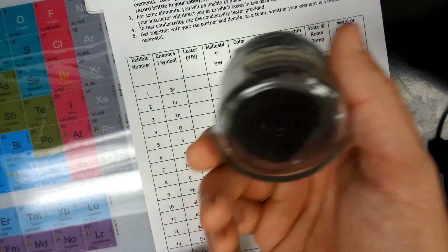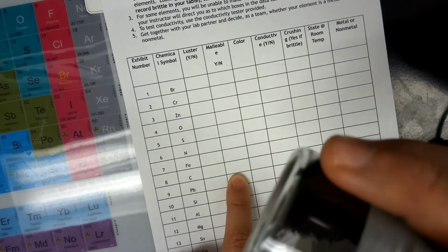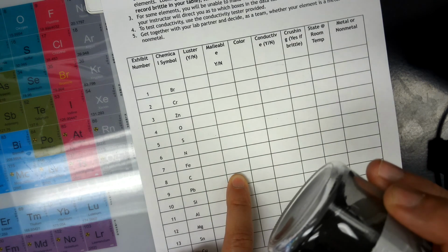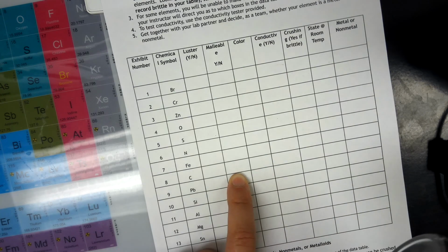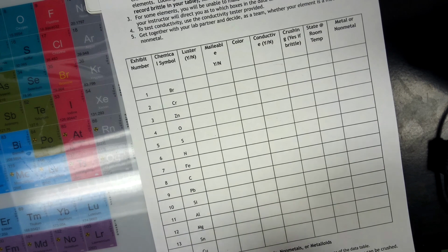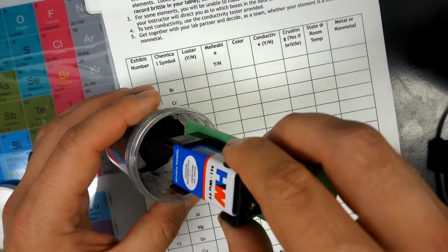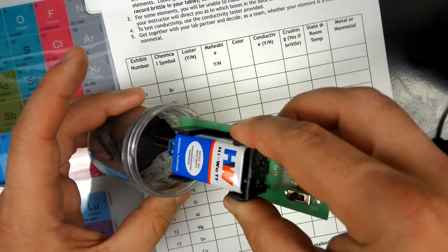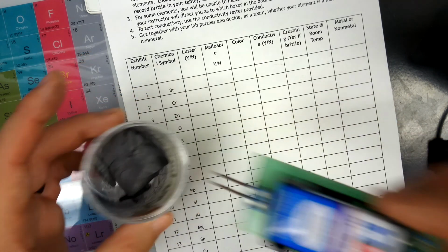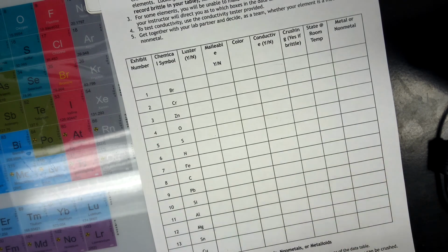So it is not lustrous, it is not shiny. It is not malleable, that's why we're able to crush it like that. We're not able to bend it, it crushes or breaks. It is black. Like I said, for students normally I wouldn't let them do this, but since we're online we can do some extra stuff, and we can see that carbon is not conductive. That's because it is crushable and it is a solid at room temperature. Leave the last column up to you.